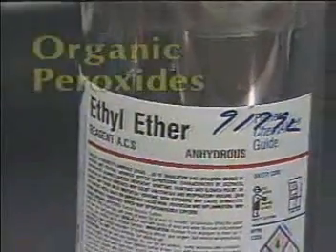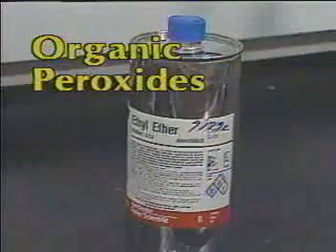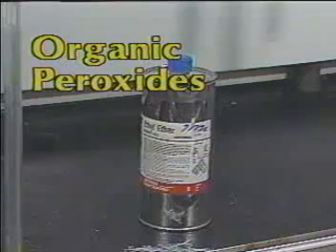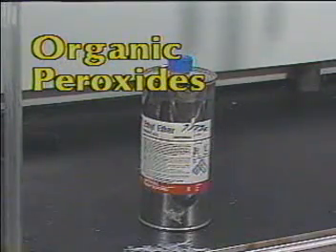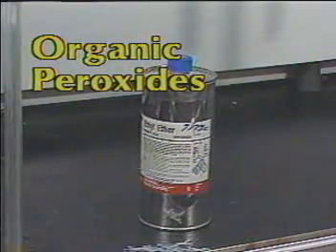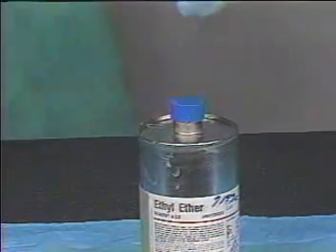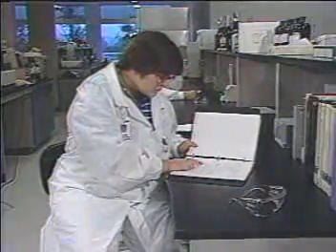Organic peroxides can form on containers of diethyl ether. Peroxides are notoriously unstable. They're highly flammable and far more susceptible to shock than even TNT. Something as simple as the friction generated by opening a contaminated can can cause an explosion. Check your material safety data sheets and other guides before you handle or store these substances. Know the problems which could surface.